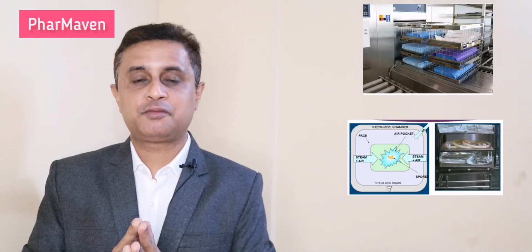The next question is, how do you determine your load patterns? Our load pattern determination practically comes from how many items we will need. Then we categorize and define them in certain load patterns. For example, we have a specific load pattern for stoppers. Small stoppers, only 13 mm, have a different load pattern, and 20 mm stoppers have a different load pattern.